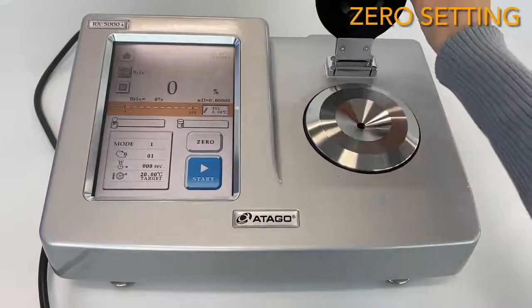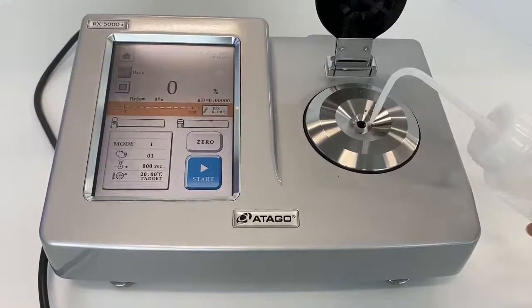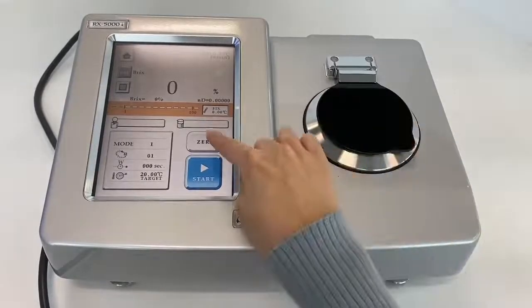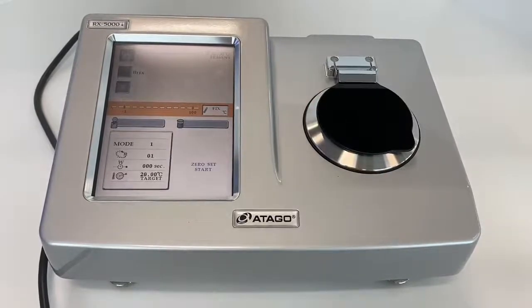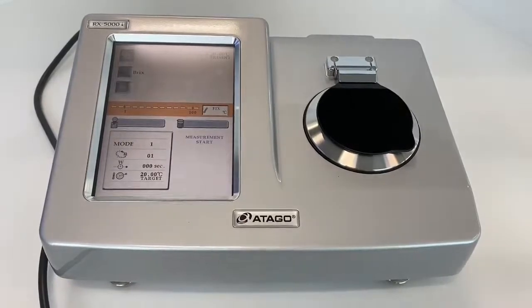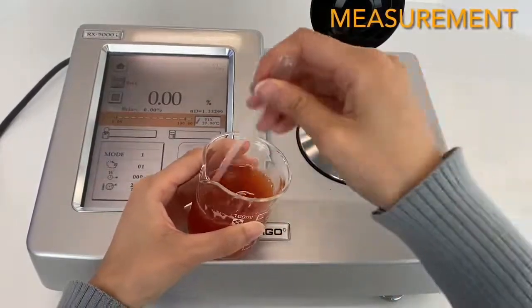If the instrument is in good condition, it's completely okay. The zero setting procedure is the same as with Rxα — you put water on the stage and press start. It is important to zero set after you clean the prism and sample stage, because if there is any build-up on the prism when you zero set, it will affect the next measurement.